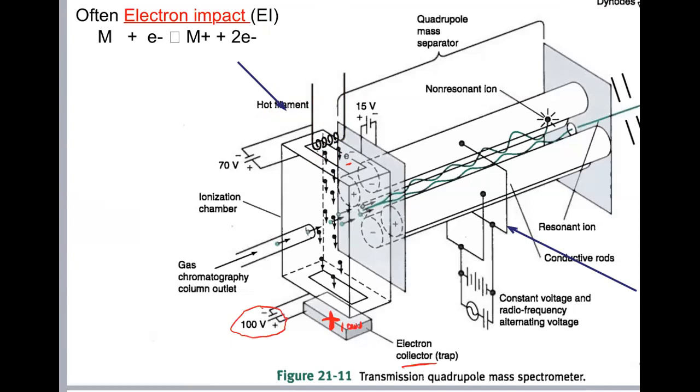So once those electrons are produced, they are going to say, hey, there's a positive electrode down there. I am headed that direction. And they will eventually collide with the collector electrode, okay? Now that doesn't sound very interesting by itself, just accelerating electrons from the electron gun, the filament, into this collector electrode. But it is kind of interesting actually, because we ensure that the electrons go from top to bottom. In addition, during their journey, they're really accelerated along the way under this 100-volt potential difference into very high velocities, relatively high kinetic energies on an atomic or molecular scale.